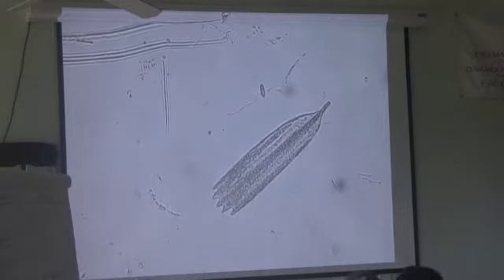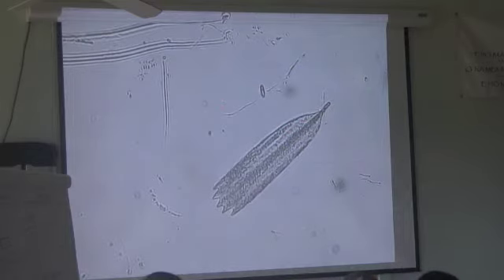It seems like it would be hard to quantify these things that are running all over the place. It's a little difficult. Sometimes it takes some patience. I don't know whether you're looking at the same guy twice. Yeah. This is why you don't want to take too long. Isn't that cute? This is a piece of pollen. So can you imagine when you leave this in? What is that going to do to your nasal lining? Yeah, nasty. Some of the pollen is just really knife-like and really unpleasant.